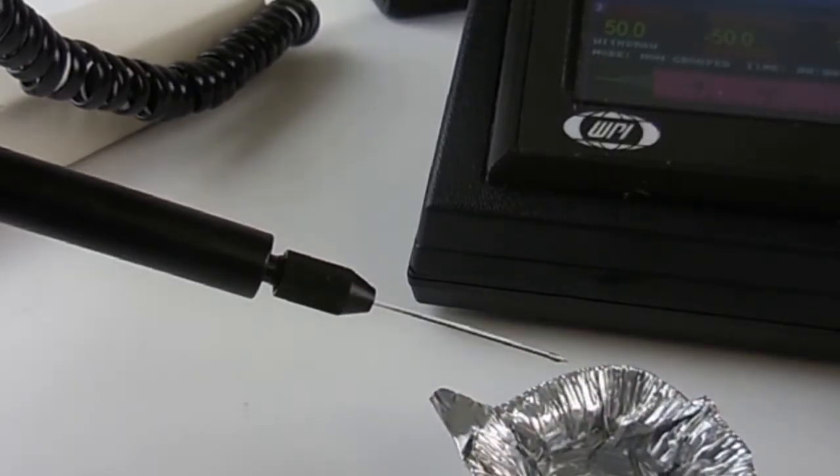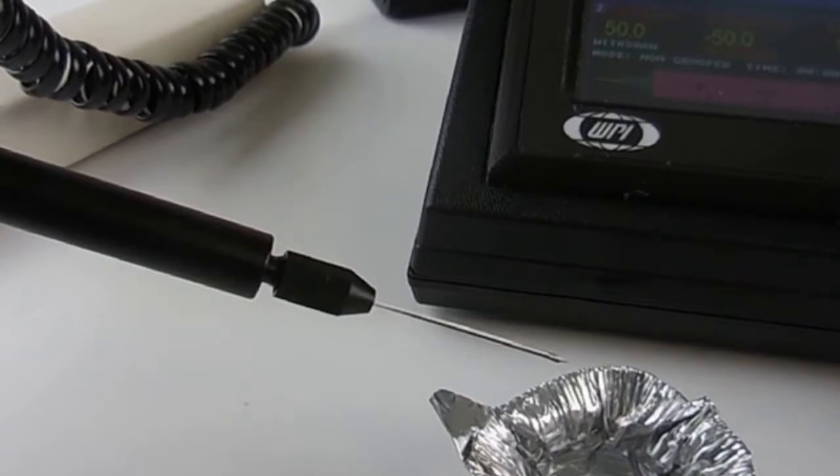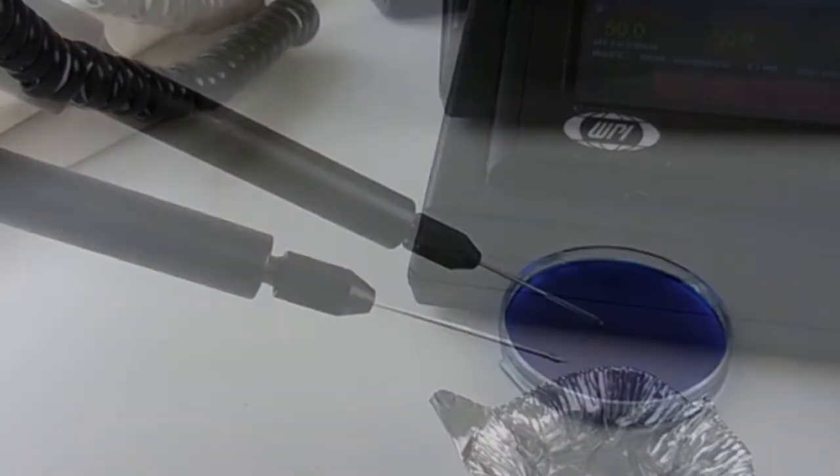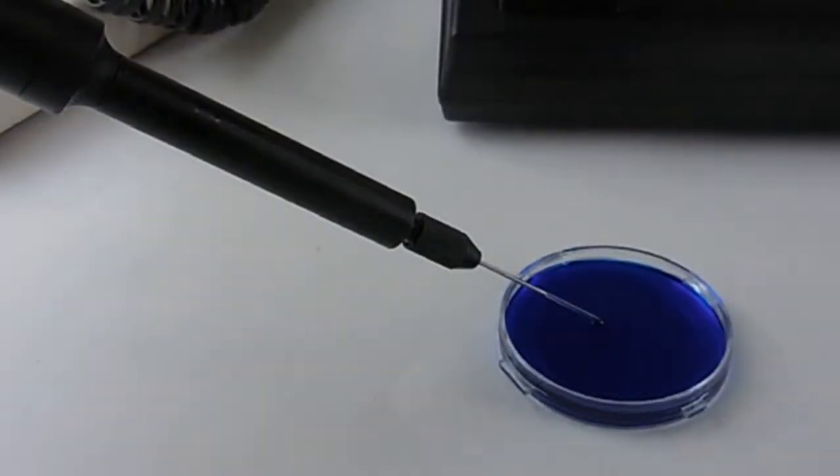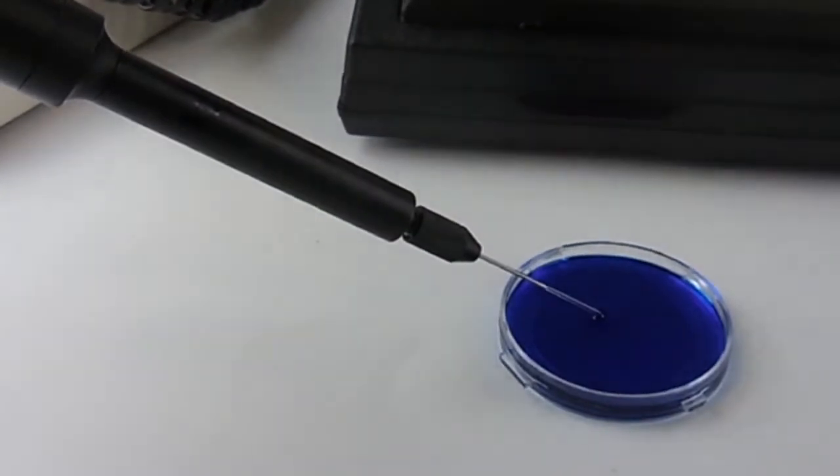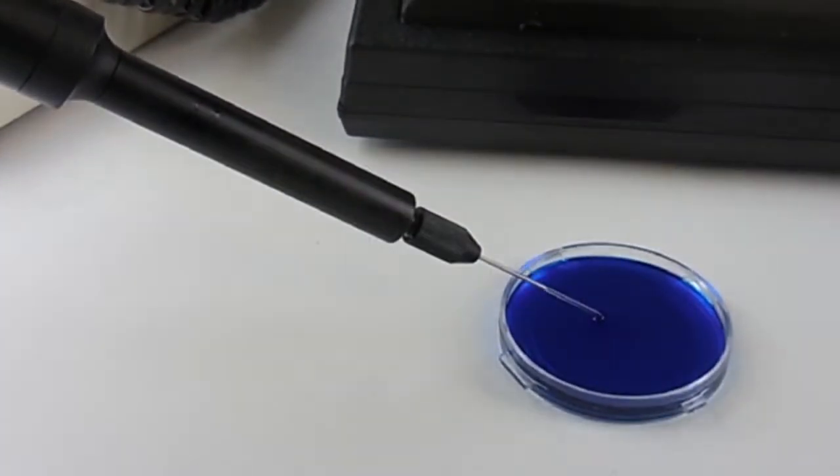Once you have dispensed the total volume, now bring the micropipette to the liquid you want to inject. With the micropipette in the solution, change the direction on the Micro 2T to withdraw. If you are using the standard controller, press the fill button.